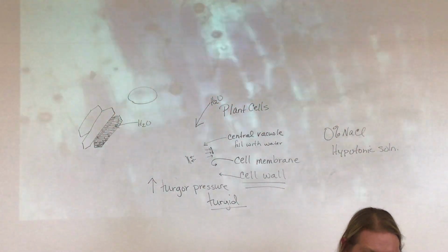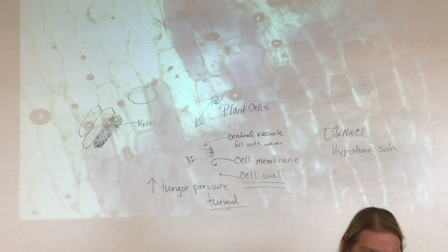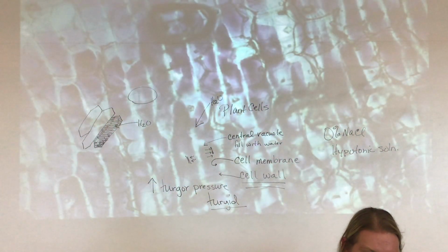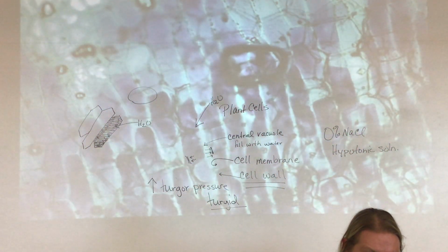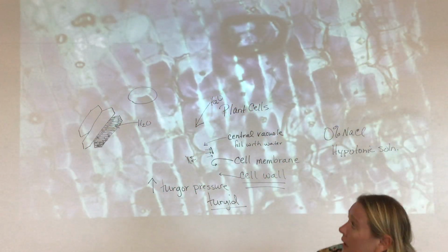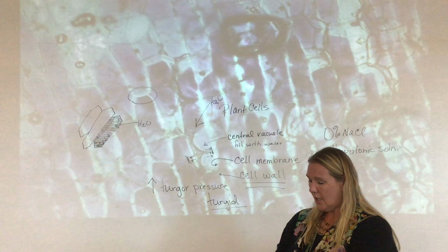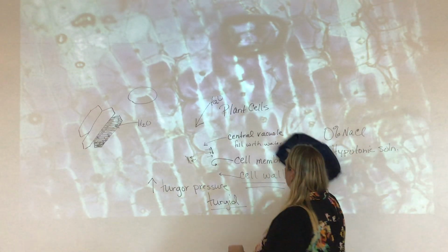There we go. That's what we want. Much brighter. Let's see. In the middle. Okay. All right, so as this goes, it's going to take a few minutes.